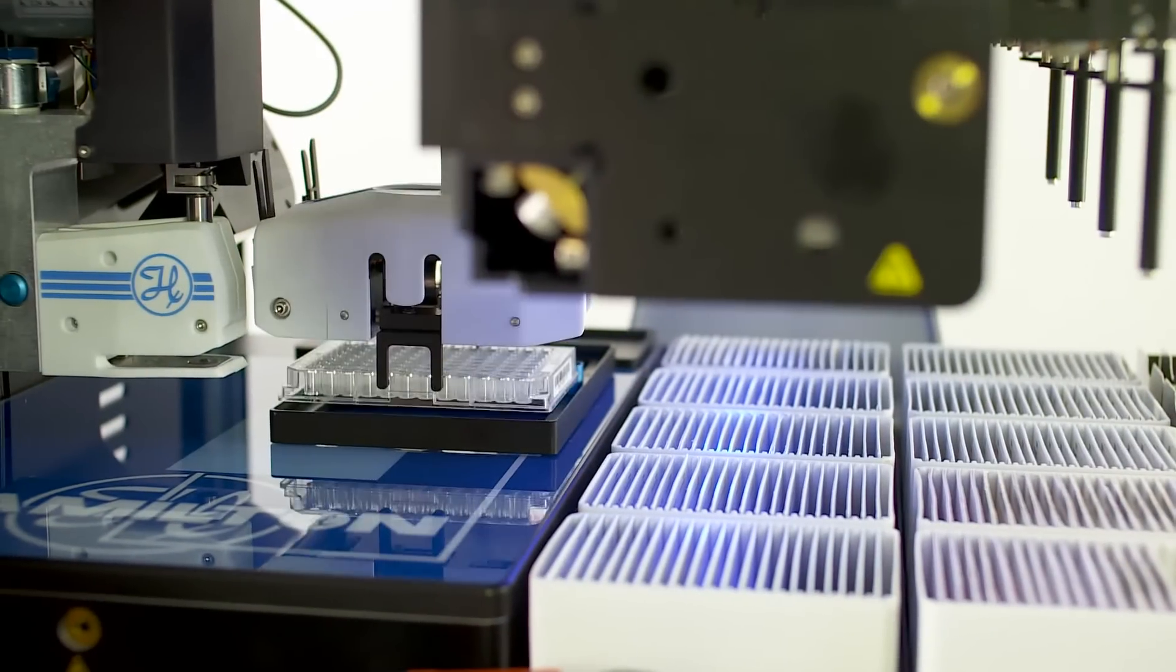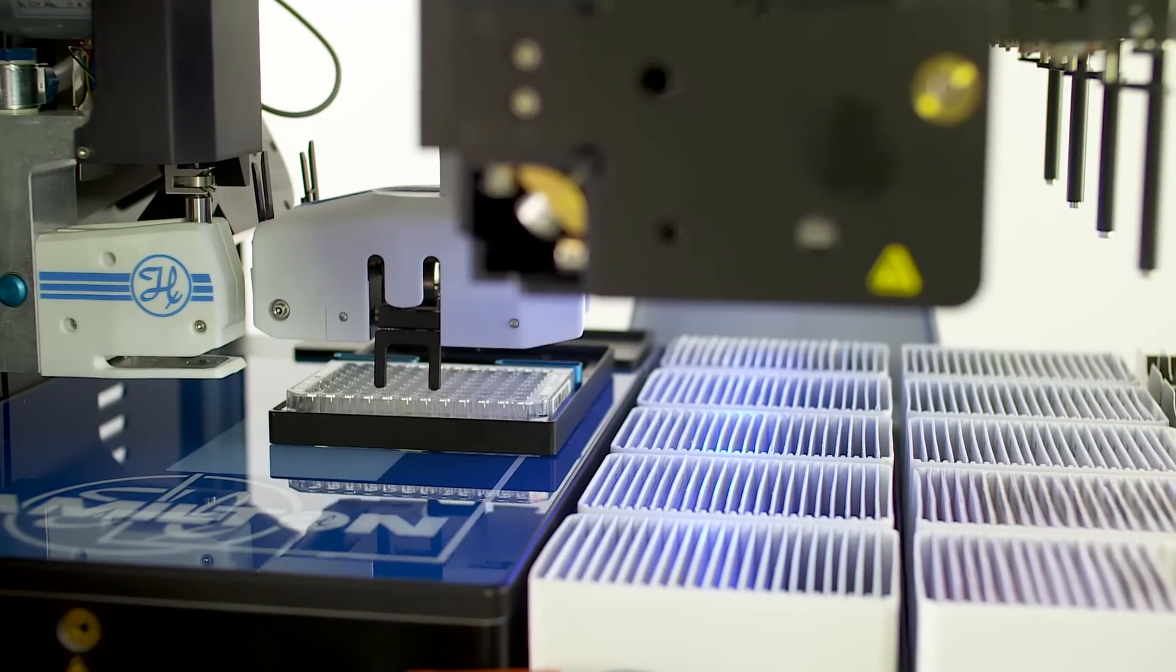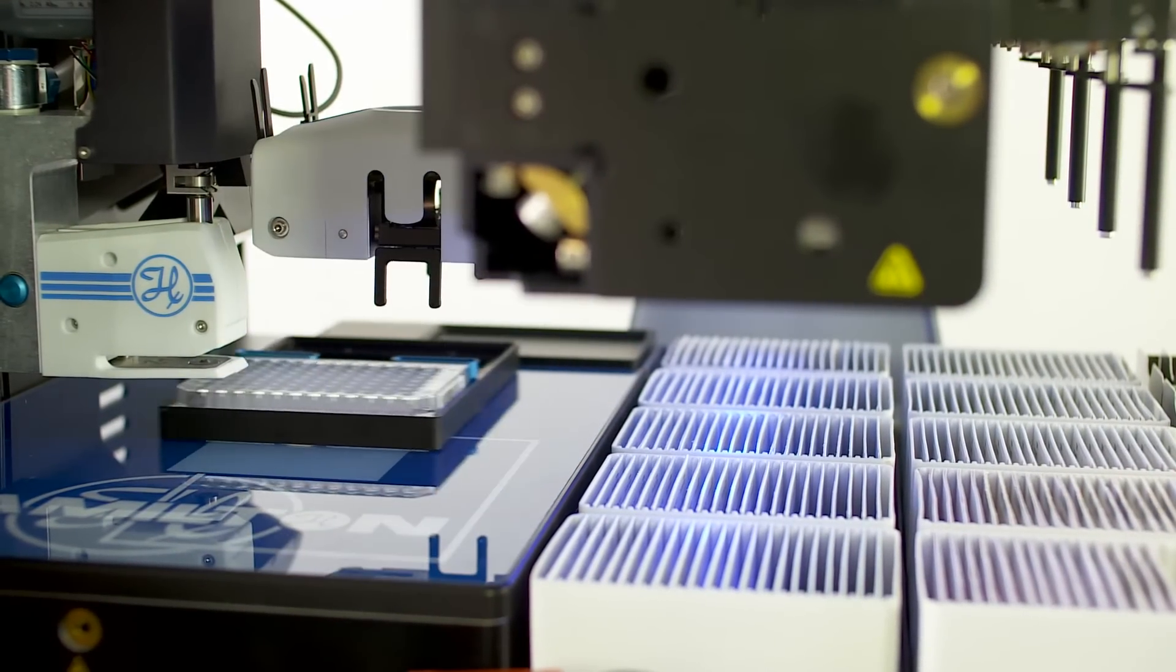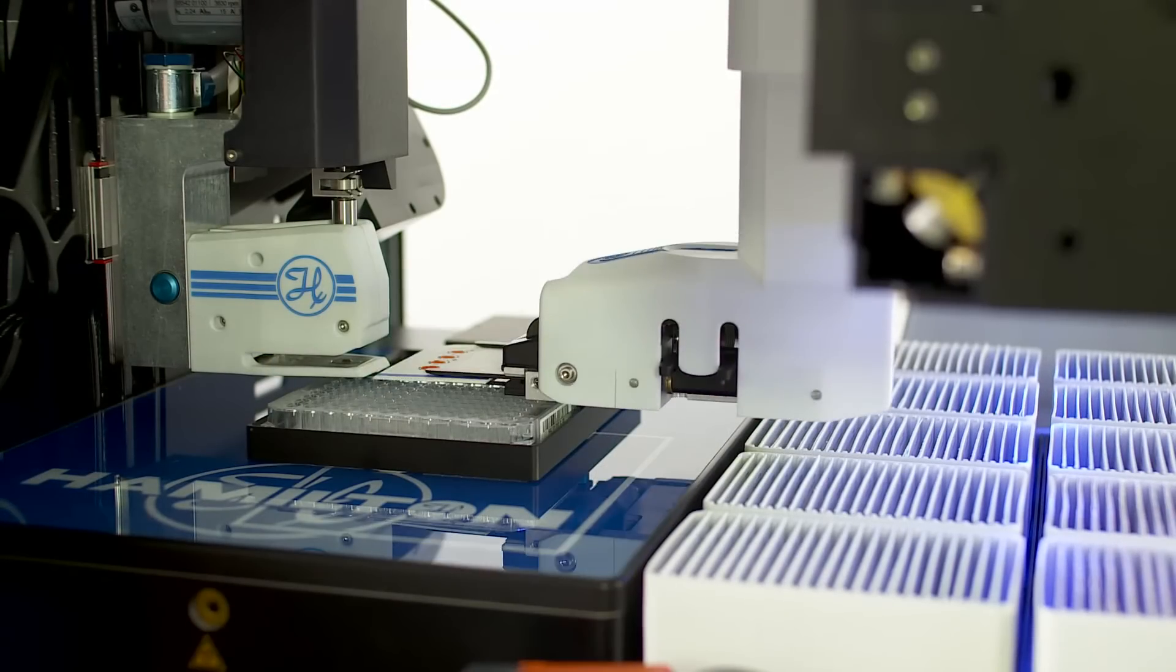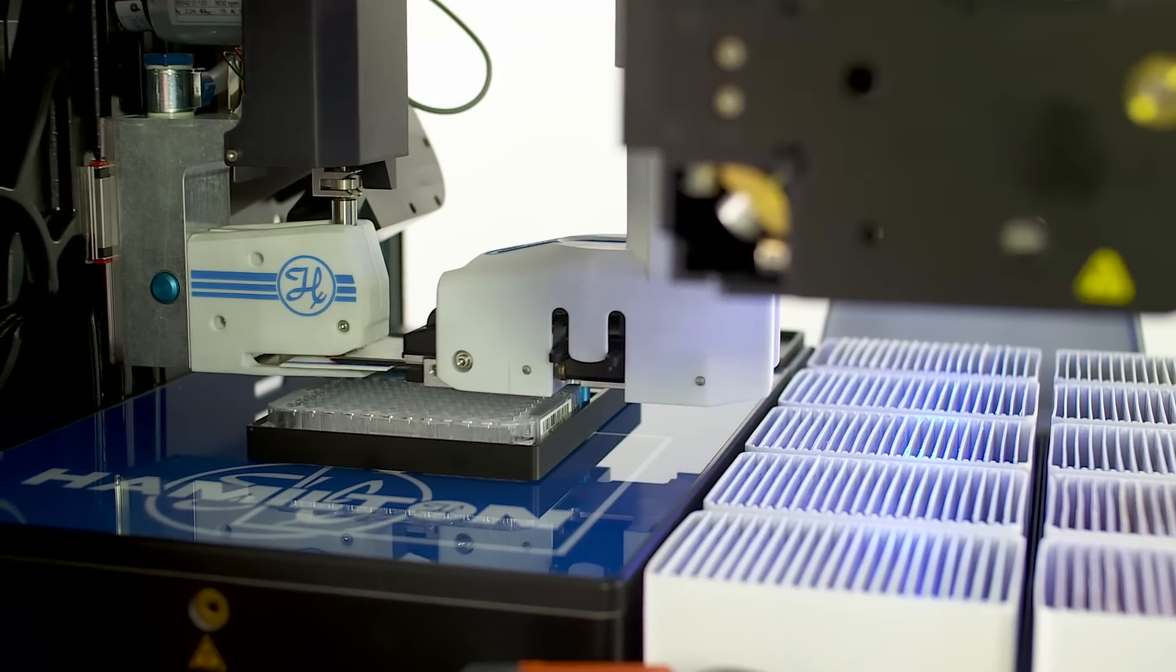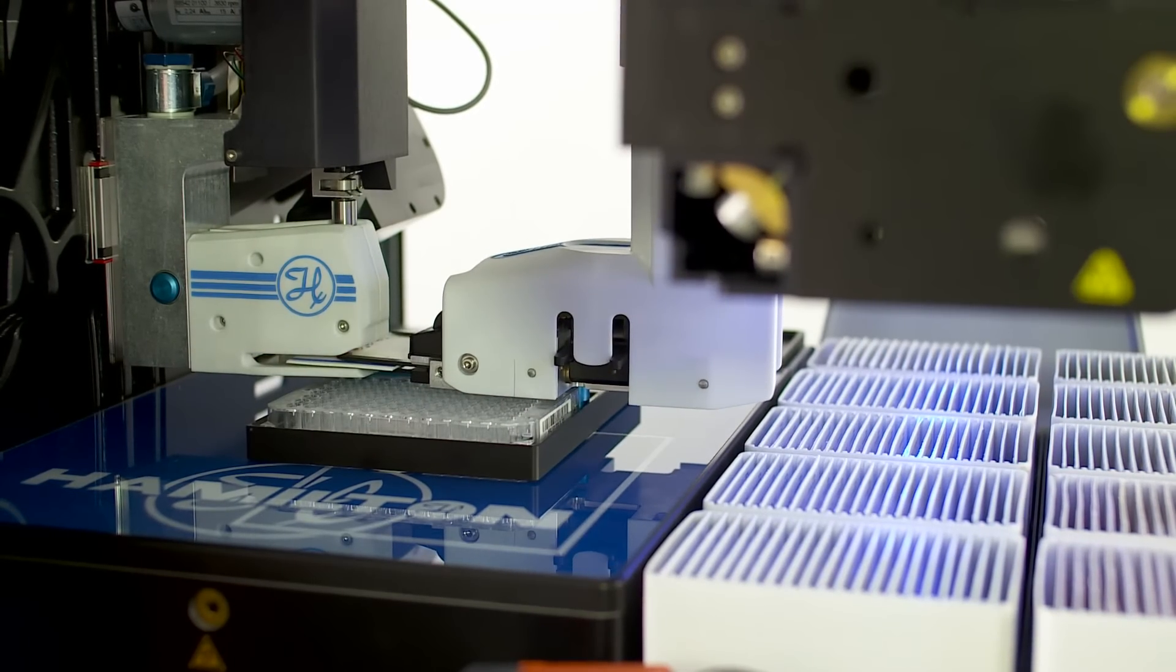EasyPunch is the first commercially available system integrating sample card punching and extraction into one automated workflow.